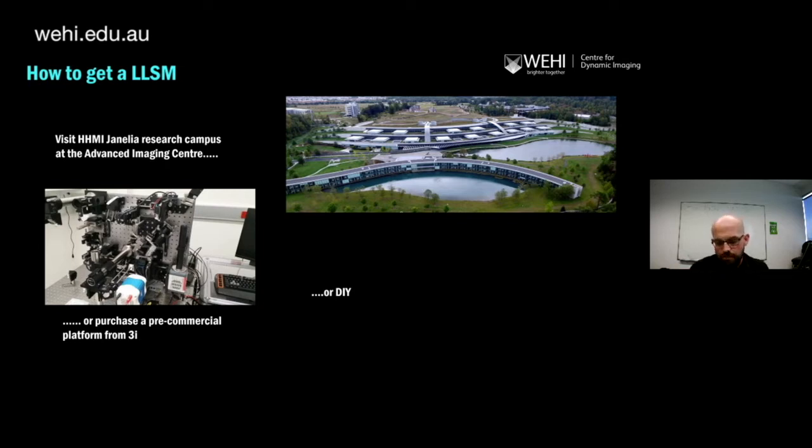So they had this program where you could send someone over for 2 weeks, and they would sit you in a room, in a classroom, with other people to learn how to build the system, screw by screw, lens by lens. And so Lachlan went over to Janelia to do this. And when he came back, Kelly said to him, "Do you think we can do it?" And Lockie's exact response, and I quote, "I don't see why we can't."